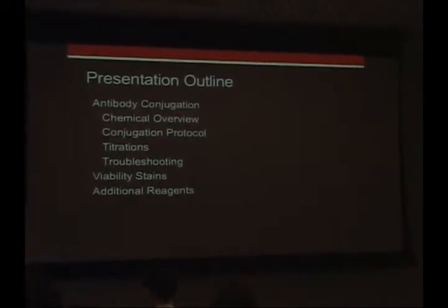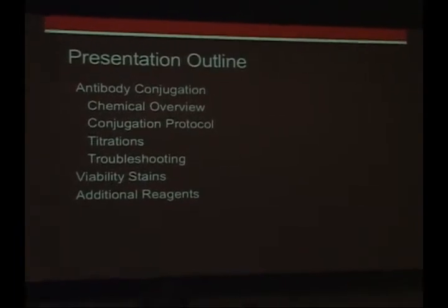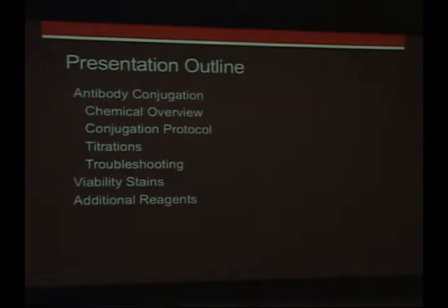I'll walk through some titration data, how to optimize the reagents that you've generated. And as I mentioned, that really applies to fluorescence-based flow as well. And then some troubleshooting tips if things aren't looking quite as beautiful as you would hope they might.